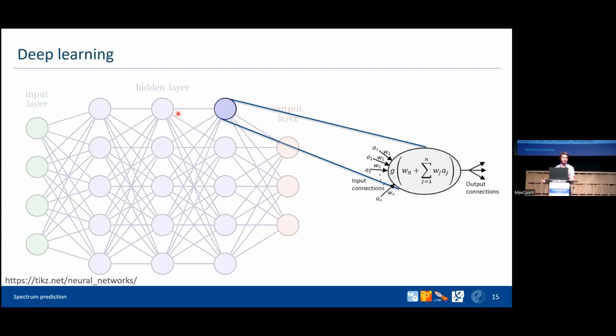One of the hallmarks and the main advantage of deep learning is the ability of neural networks to learn higher level concepts from the data itself without additional feature engineering. And this greatly simplifies the pre-processing of the data, but comes at the cost of the need for increased quantities of data to train models and a lot of computational resources.